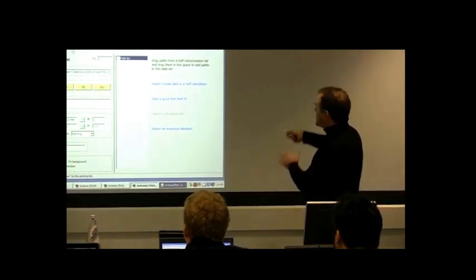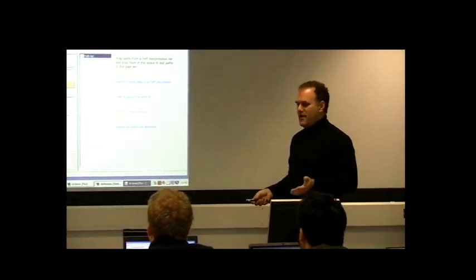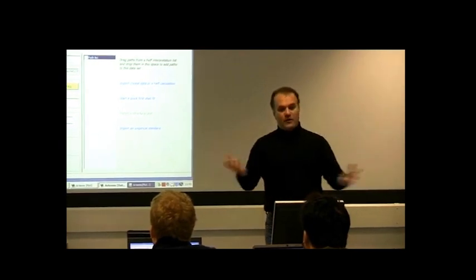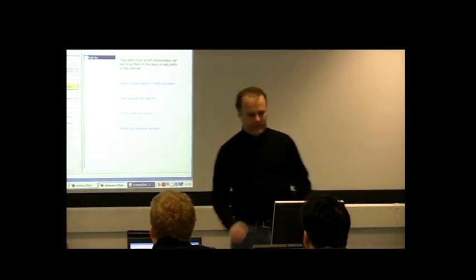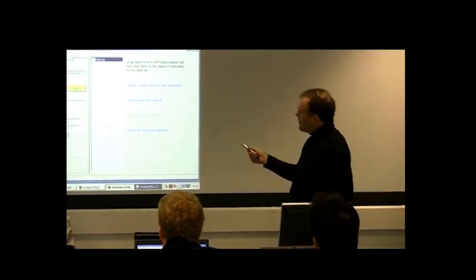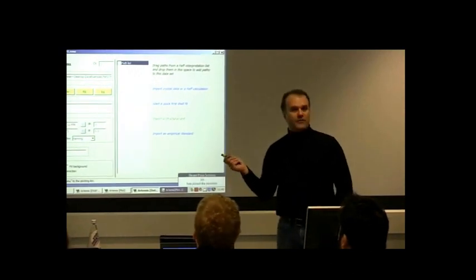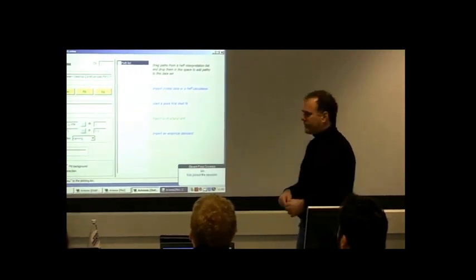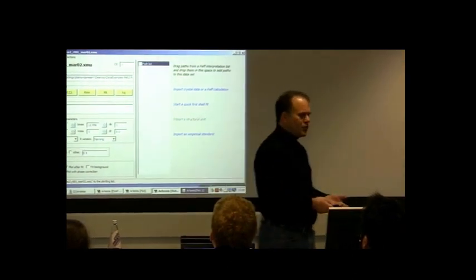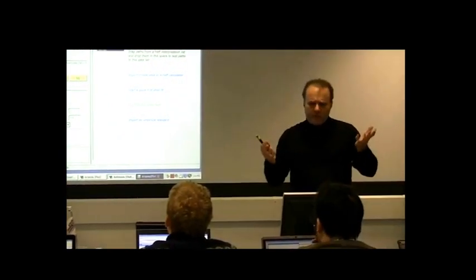What's going to happen over here is all of the stuff associated with the theory. And again, I'm just going to start showing you how this works, and hopefully it'll all start to come together and make sense in a little while. So FeS2 is a crystalline material. It's relatively simple. It's a cubic crystal, but it has some interesting internal structure. It's basically iron surrounded by sulfur, and we'll see how that works.